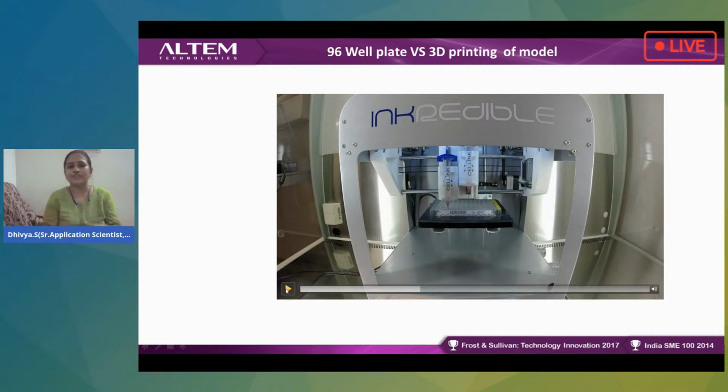If you look into it, for instance, if I say about an assay that you want to perform, we used to take this 96 well plate and load it with pipettes, and we used to have lots of instruments around us. But one such machine is going to do all the work. That's how it's going to be automated and transitioning towards a new technology.